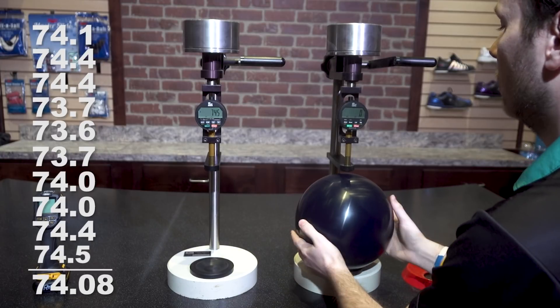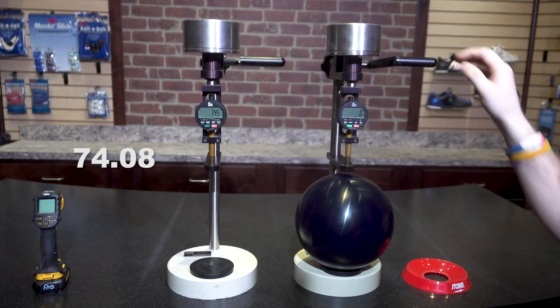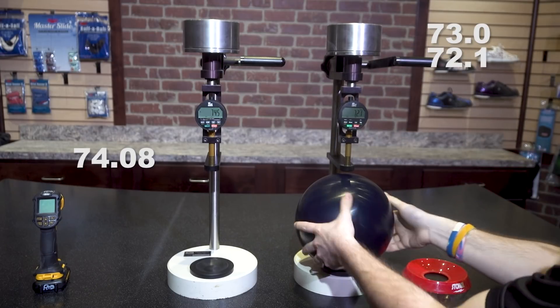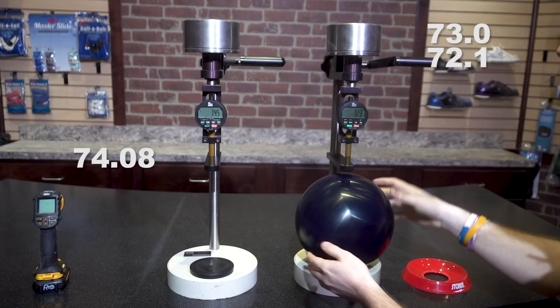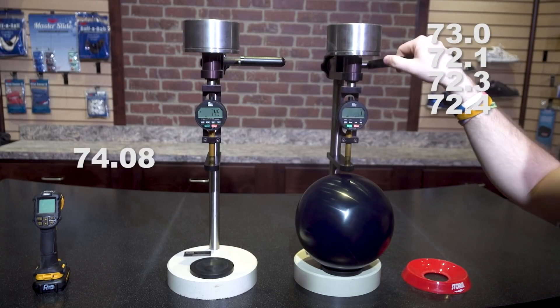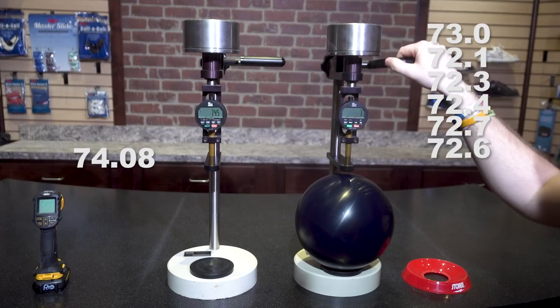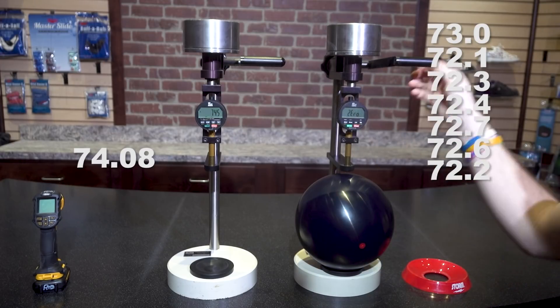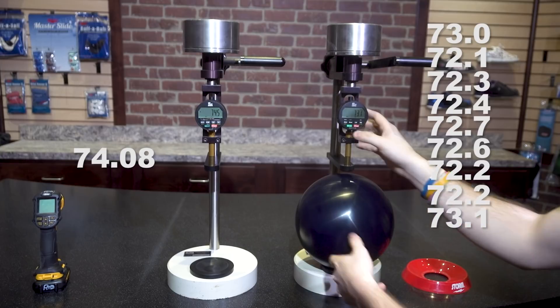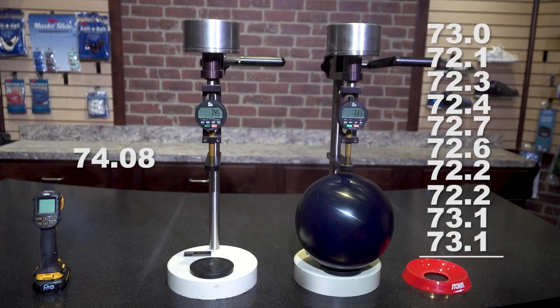Now we'll bring this exact same ball over to our other calibrated durometer and see what differences we find. Readings on the second durometer: 73.0, 72.1, 72.3, 72.4, 72.7, 72.6, 72.2, 72.2, 73.1, 73.1. That gives us an average of 72.57.